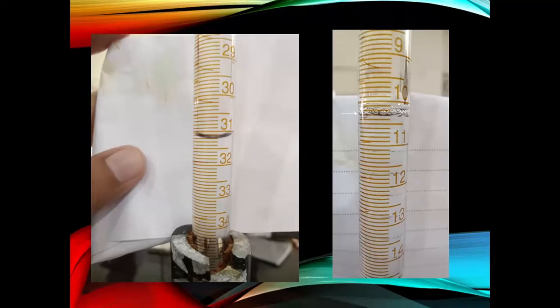See, another important thing, that although it is readable, the reading is not clear because of these bubbles. So we should avoid bubbles at the surface or anywhere in the burette. And here you can read it very carefully. So think about it. What should be the reading? Okay, see, it is 30, it is 31, it is 32. So the least value is 0.1.